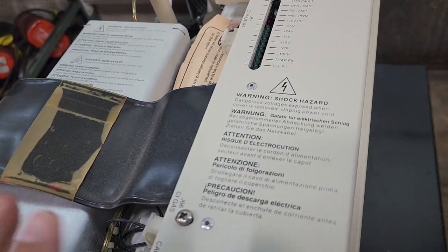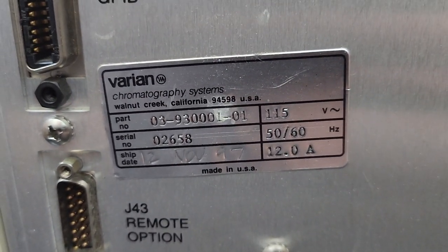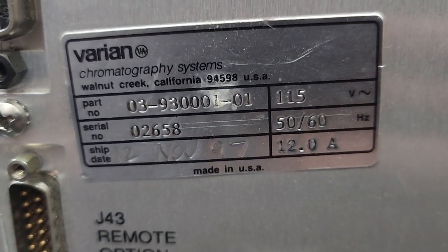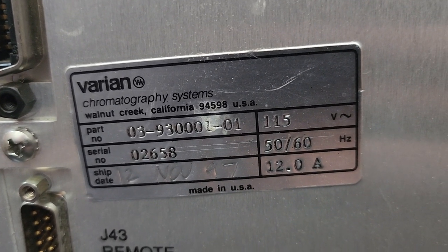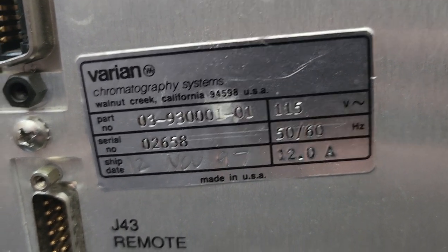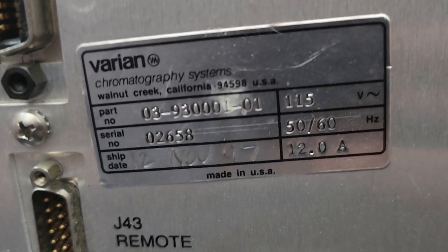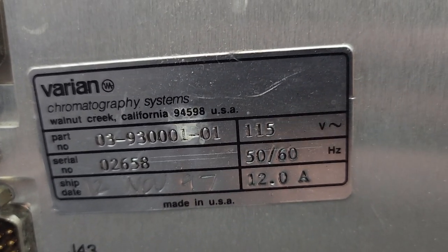I got the covers off here because I wanted to show you what I actually found back here, but let me get this tag over here. This is a Varian. You think I can read that? I'm sure it's easier to read on the screen, but I'm looking at my phone. 0393000 and then maybe 1-00. I can't read it. Let's take a picture of it.